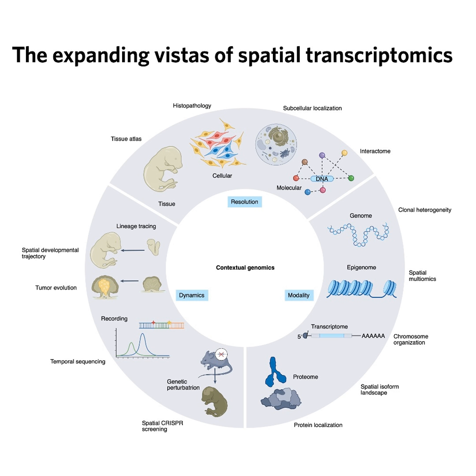Well, two main examples are often proposed in the literature. First is the adult mouse olfactory bulb. It has these 5 very clearly defined molecular layers with well-known gene markers for each layer, very structured. The second is the embryonic day 12 to 14 mouse embryo, specifically looking at a sagittal section that includes the developing eye. The eye provides these really distinct, highly reproducible, symmetrical histological layers. That makes sense. You have clear landmarks.